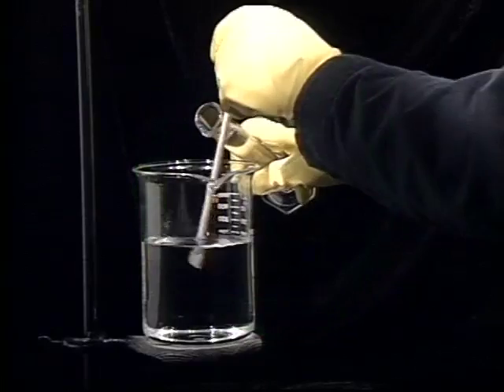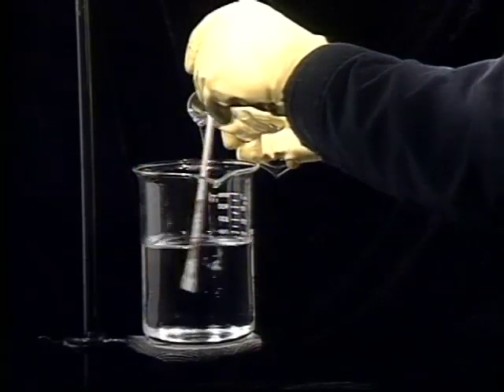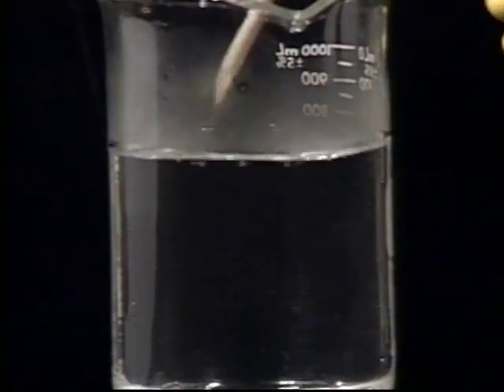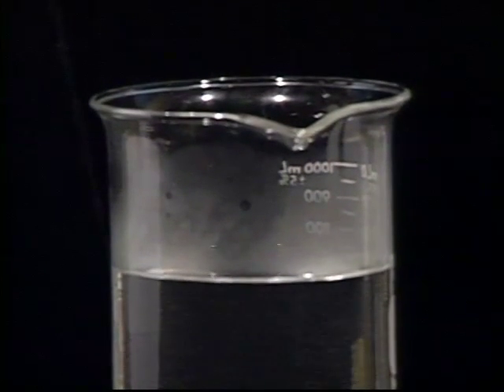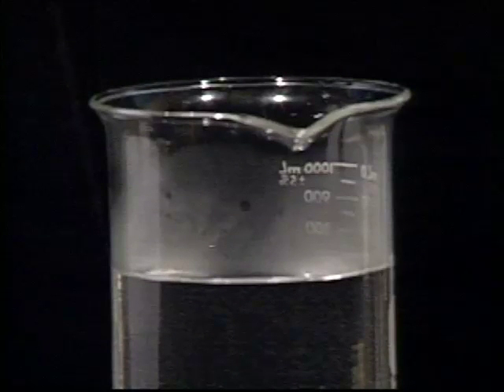There is only one way to do it right. Always add the acid to the water. Add it slowly while stirring. The larger volume of water will absorb and dissipate the heat generated by the reaction. This same principle applies when combining a strong acid solution with a weaker acid solution.